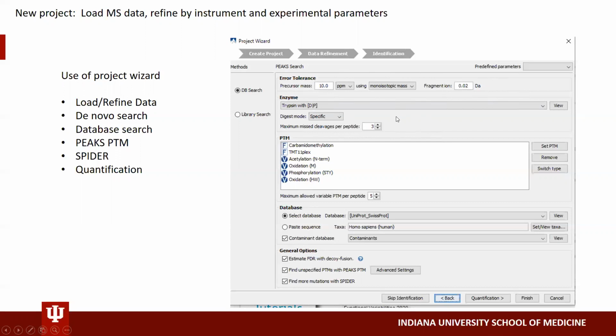I will say that this specific software is actually incredibly useful for situations where you're looking at de novo peptides. That is, if we're not digesting with trypsin, we don't know which amino acids will be present at the beginning and ending of a peptide. And so it's very challenging in terms of a normal database search. But if you're looking at just bioactive peptides, this algorithm can be really helpful.